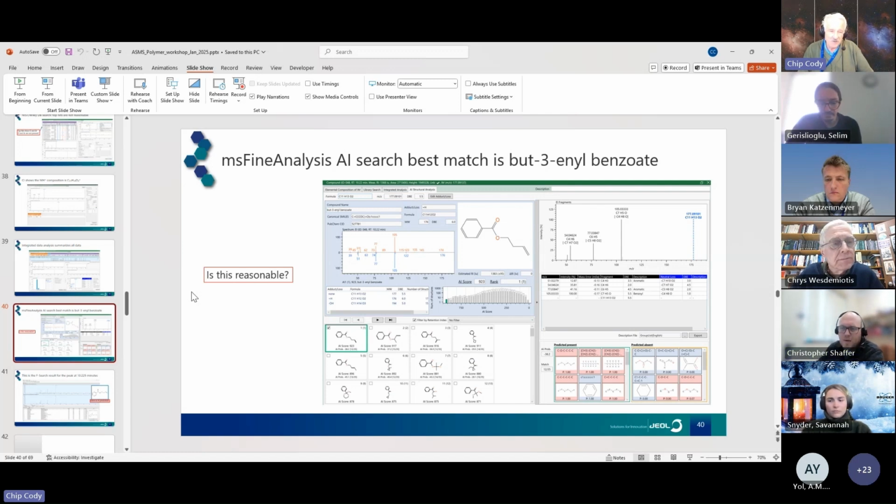So you can specify, this peak is in your soft ionization spectrum that matches this peak in your EI spectra, and you can do that for several data points to align the chromatogram. We're also doing that in the GCGC data. I know that when I open that up, there's an option to interactively align the x-axis, but I haven't had to do that for my data. I think we'll follow up with some more questions on that later on. Sure, that sounds excellent. Thank you. You're welcome.